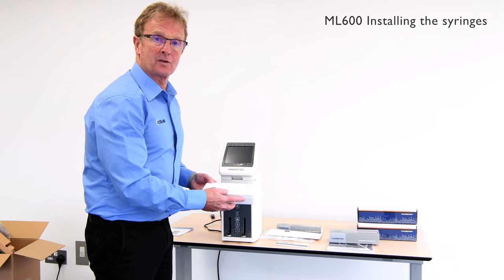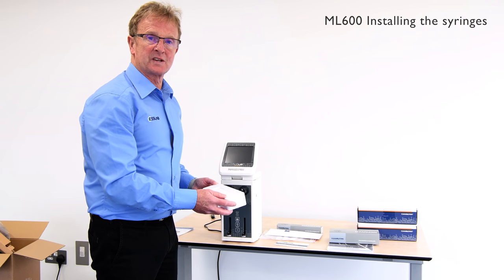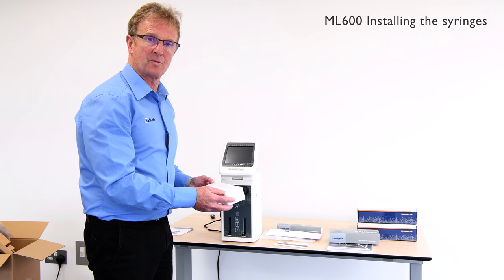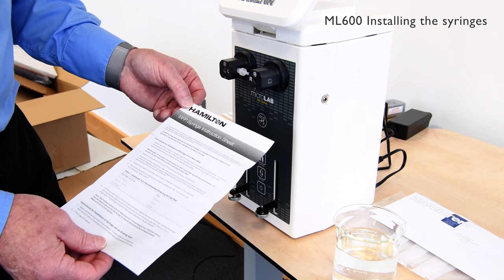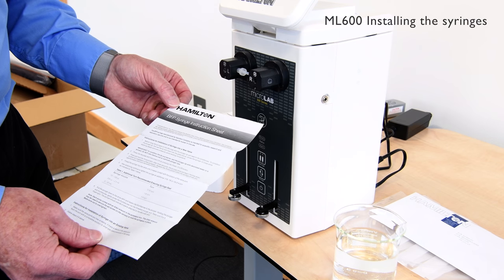So what we're going to do now is fit the syringes to the instrument. The Hamilton syringes have been specifically designed to actually fit with their valves to have a bubble-free format. Each syringe comes with an instruction sheet for the bubble-free prime syringes showing the appropriate way to assemble and install in the instrument.